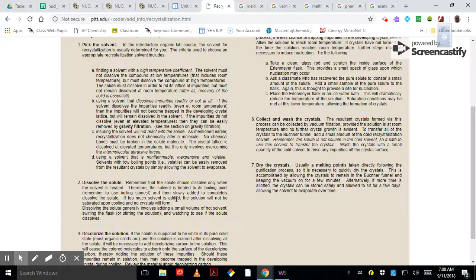Every time you have to let that hot solvent get to boiling again. The theory is that when you add just the right amount and it's boiling, all of the solute dissolves. So this is a trial and error, slow technique. You don't want to go too slowly, or your material has a tendency to boil up on the sides of the beaker, and that doesn't seem to work very well.